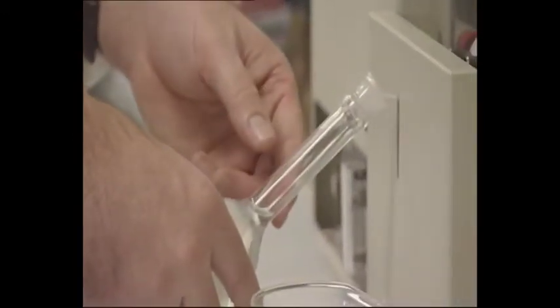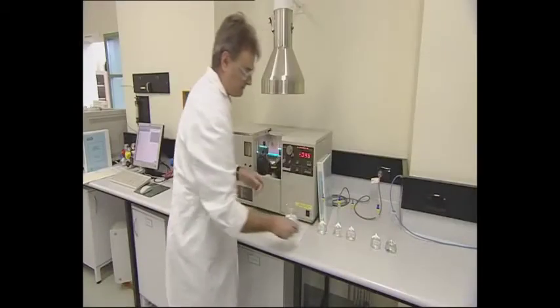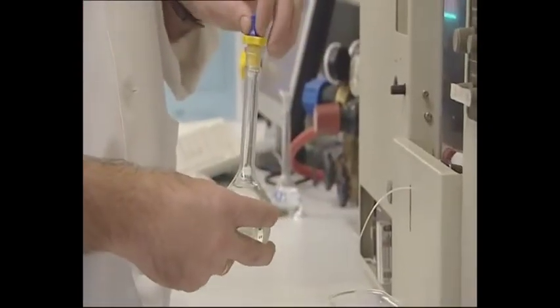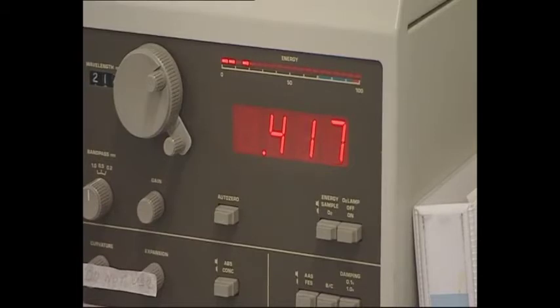Alan Walsh was able to use these unique properties of elements to develop the atomic absorption spectrophotometer, often abbreviated to AAS, a tool that revolutionised quantitative chemical analysis, providing, in Walsh's own words, a quick, easy, accurate and highly sensitive method for determining the concentrations of over 65 chemical elements, in the process rendering obsolete a raft of slow and sometimes dangerous wet chemical methods.